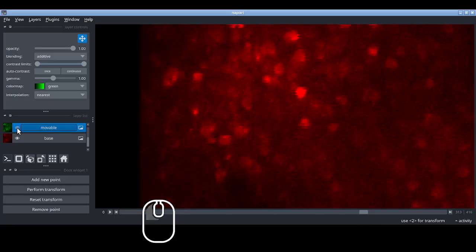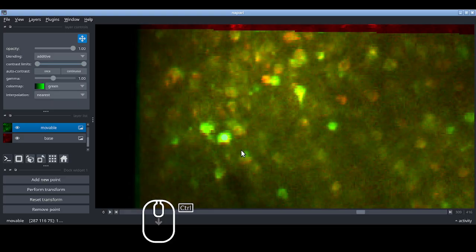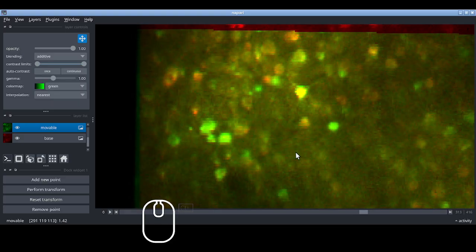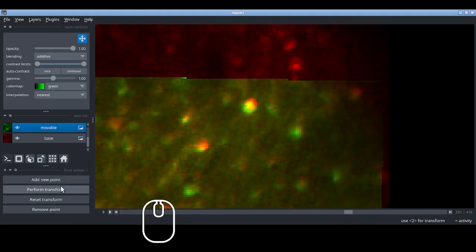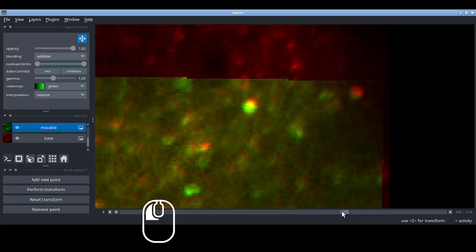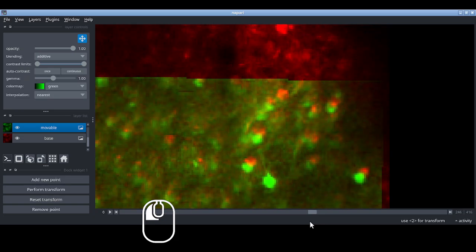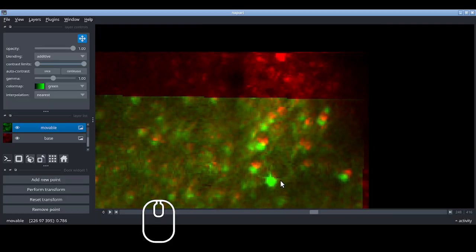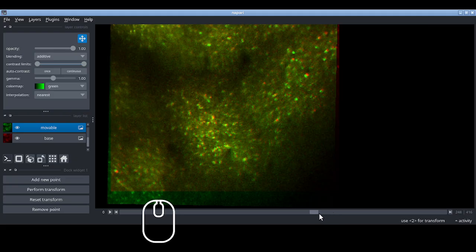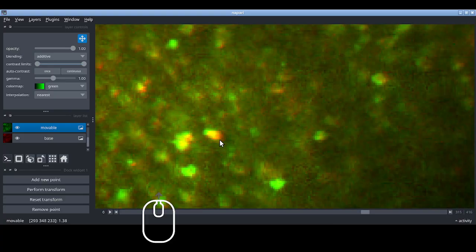Let's flip on and off. Let's do this one. This one looks good. We can scroll in and out and make sure, yeah, it looks good. What about over here? Let's try another one. These are nice. Let's do those. There we go. Now let's do one more towards the top up here. Maybe how about these? Those look nice. Now if we go down here, let's try another one. Let's do the bottom first. I don't know, this one looks fine.